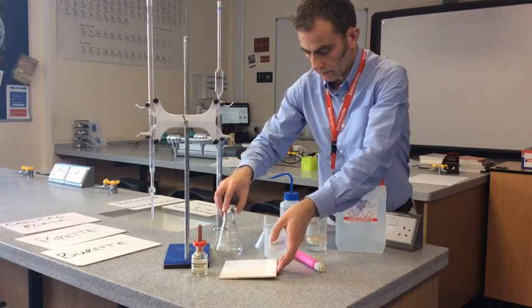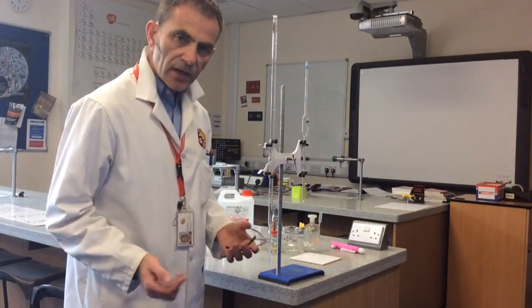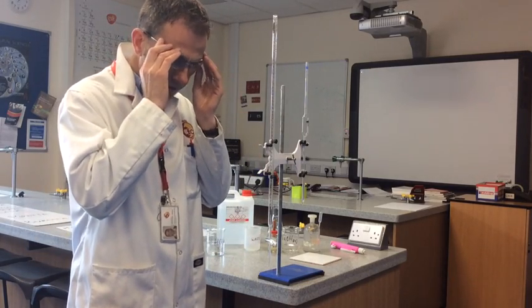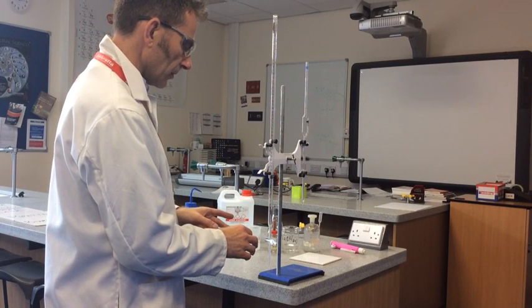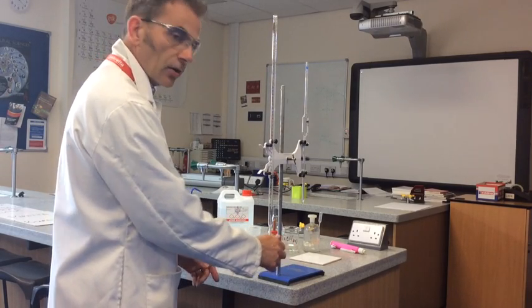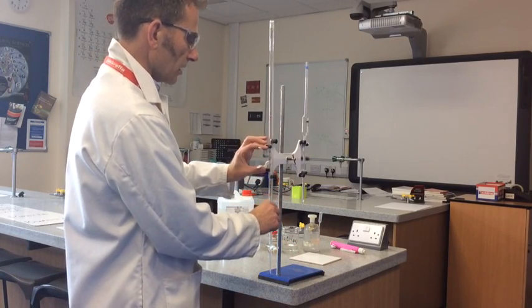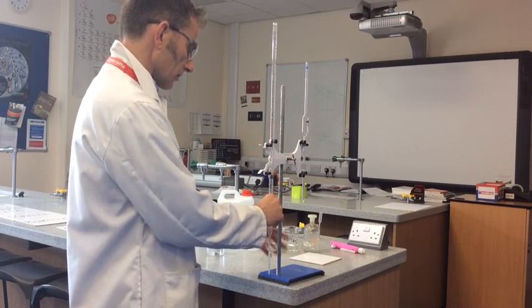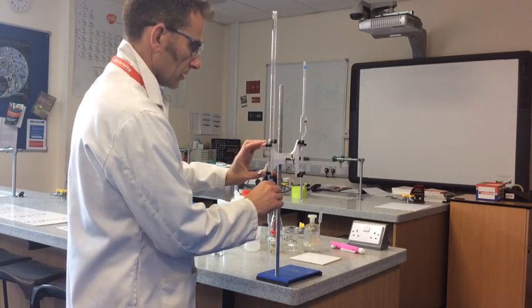Obviously the first thing we need to do is put our safety equipment on — lab coat buttoned up and safety glasses — and they need to stay on for the duration of the experiment. Now we need to fill the burette. A couple of things to know: the tap at the bottom is currently vertical, which means it's open, so close it — horizontal position is closed. Get the burette to a comfortable level; you can squeeze the clamp to adjust height. I'm going to have it so the zero is at eye level.